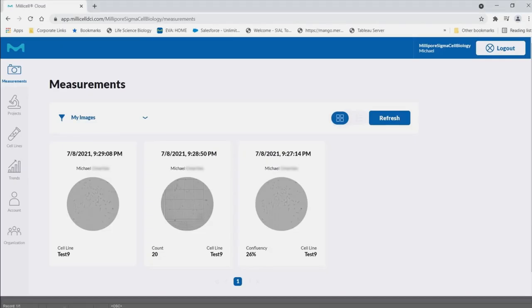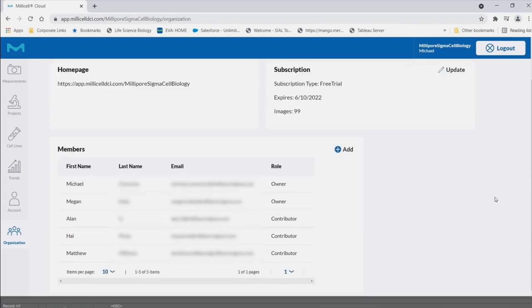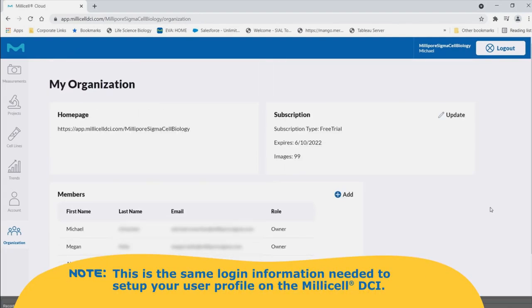The first time you log in, you will be prompted to create a new password. Note, this is the same login information needed to set up your user profile on the Millicel DCI.